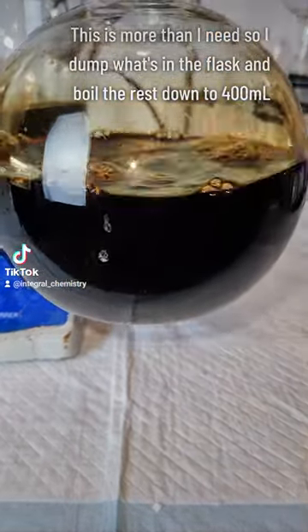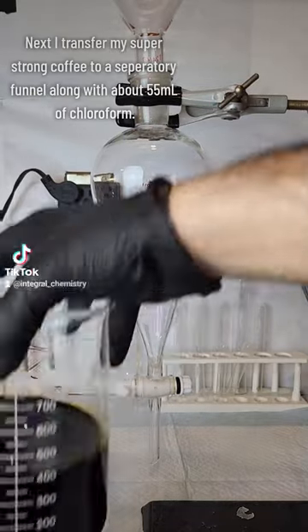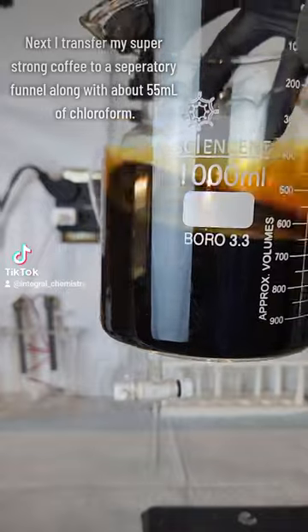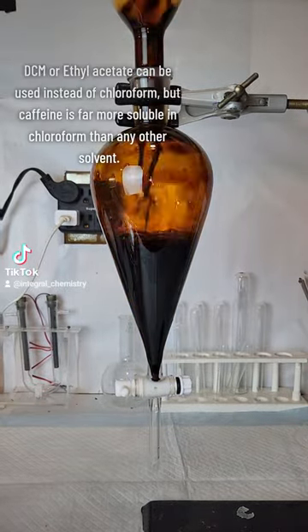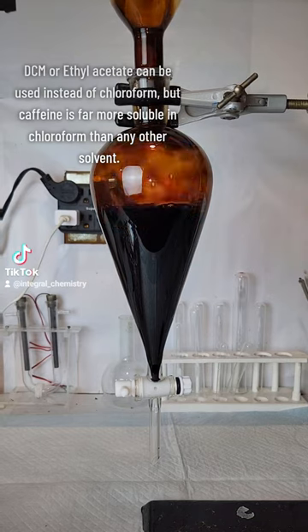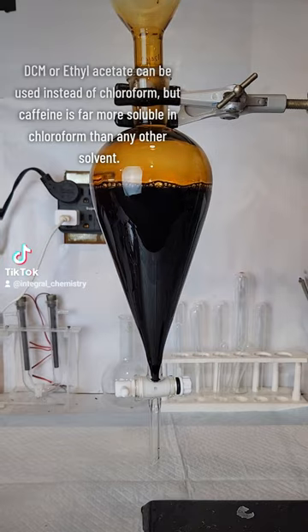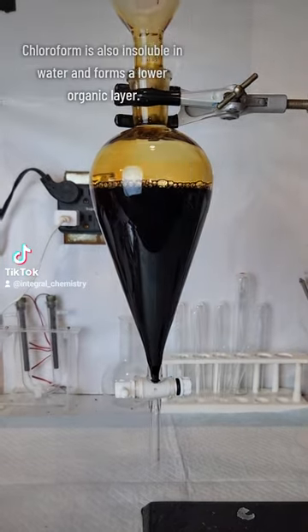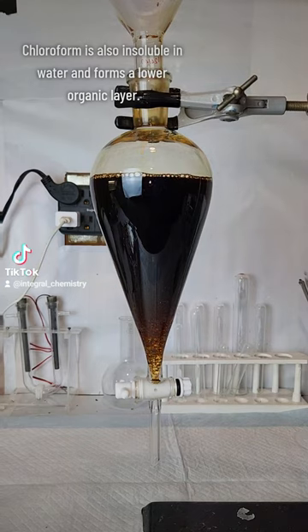I ended up with way more coffee than I want to process, so I dumped what was in the flask and boiled what was in the beaker down to 400 ml before adding it to a separatory funnel. On top of this, I add about 55 ml of chloroform, which is going to extract the caffeine from the solution. DCM or ethyl acetate can be used here instead, but caffeine has far higher solubility in chloroform than any other organic solvent, so it's the best choice here.